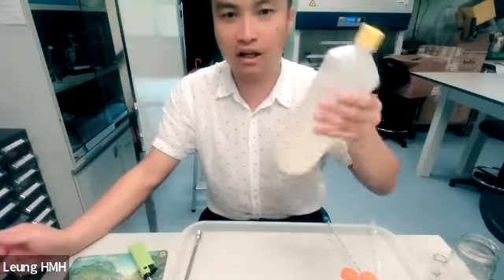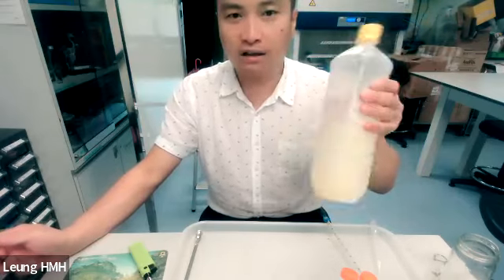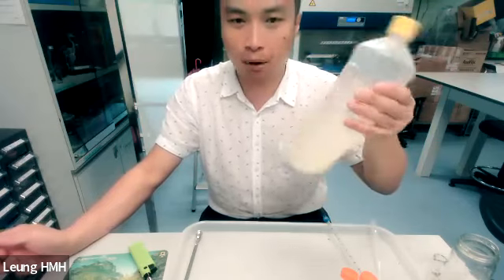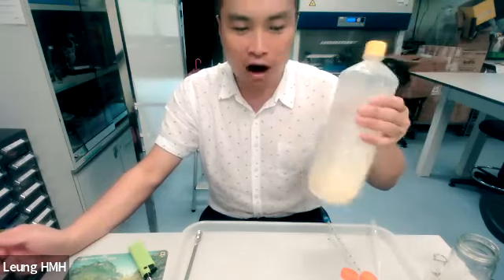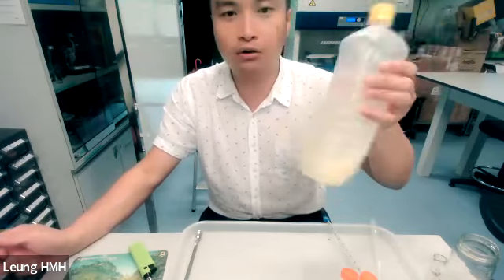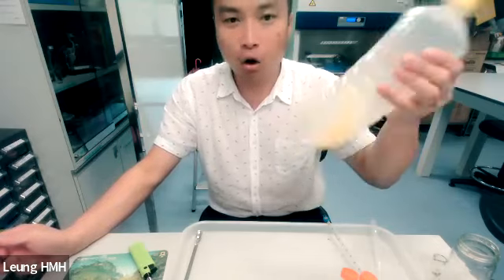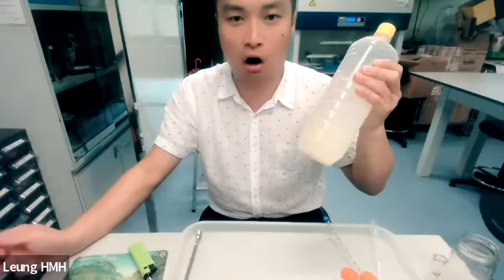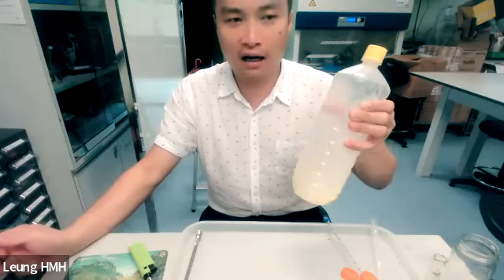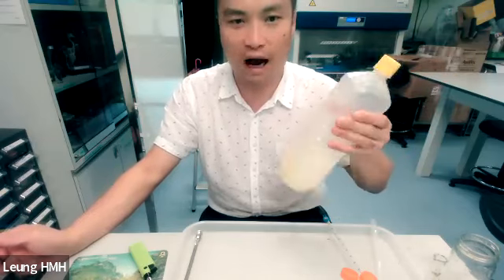And some experts try to use water to remove impurities in the biodiesel, but this is not a good practice because oil and water cannot dissolve in each other. They are not miscible. So it is not advisable to use water to remove the contaminant. Instead, we try to use another method, although water is inexpensive and convenient, right? We try to use solvent evaporation or extraction method to remove the contaminant instead of using water.